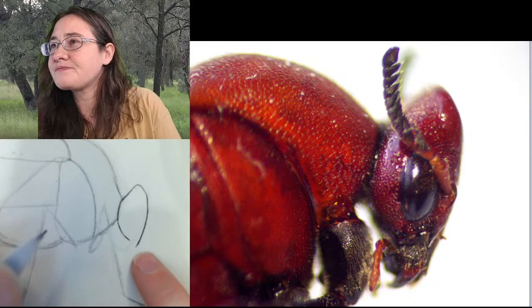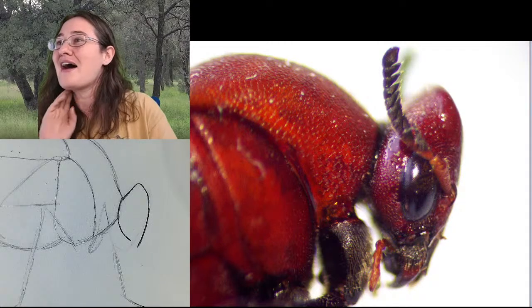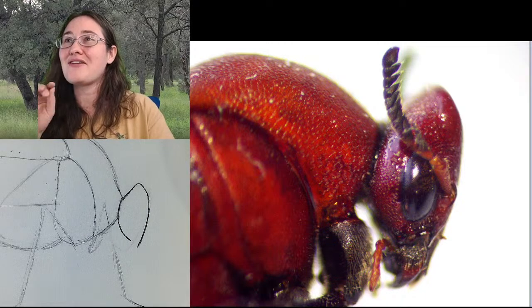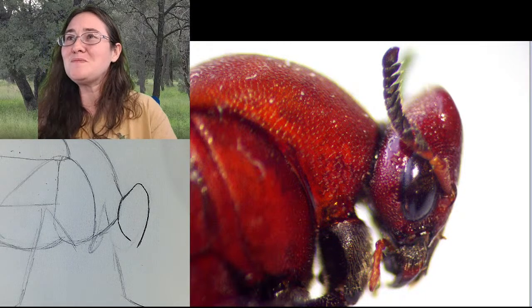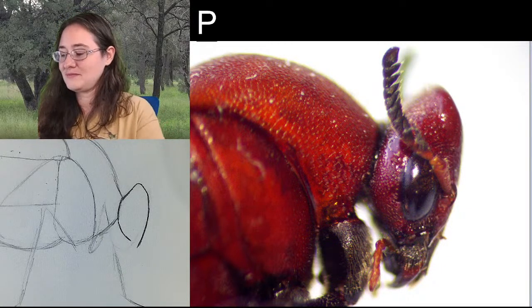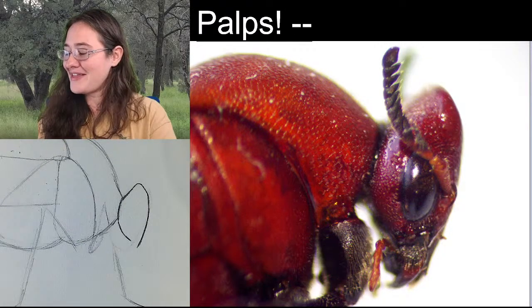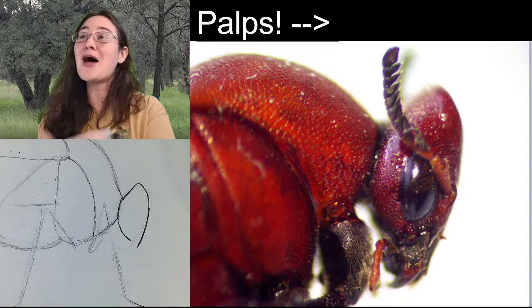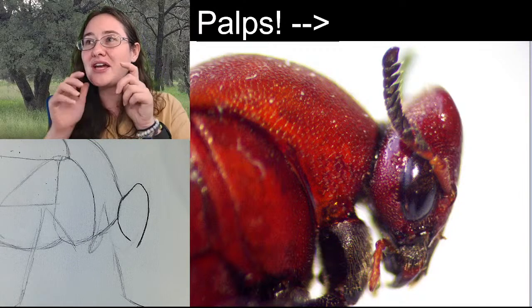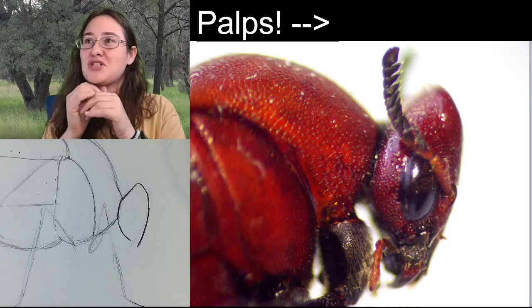Very good. So you can see that it has one of its palps down there. Wouldn't be confident in saying whether they are maxillary or labial palps there, but let me go ahead and get that for you. Where did my words go? They're there. So, I know that this is not the technical term. Palps are the technical term. You have maxillary palps that are connected right underneath the mandibles, and then you have labial palps that are connected to the labium, which is the bottom jaw.